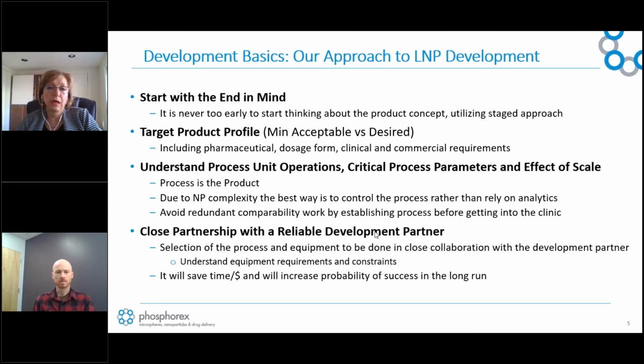Process is very important. Understand the process unit operations, critical process parameters, effect of scale. Our mantra is the process is the product. Due to the nanoparticle complexity, the best way to control the product is to control the process, rather than rely on very elaborate analytics. And that would help to avoid redundant comparability work if you establish the process before getting into the clinic.